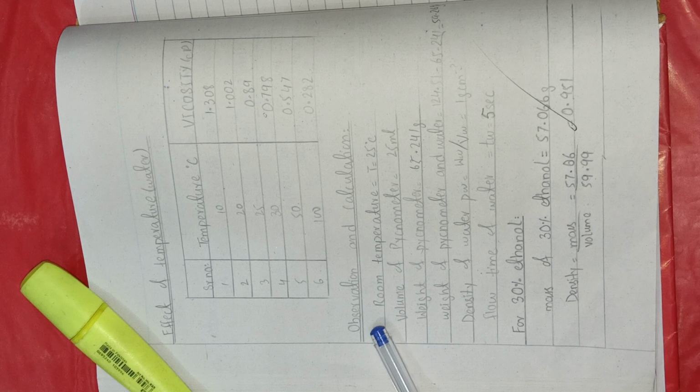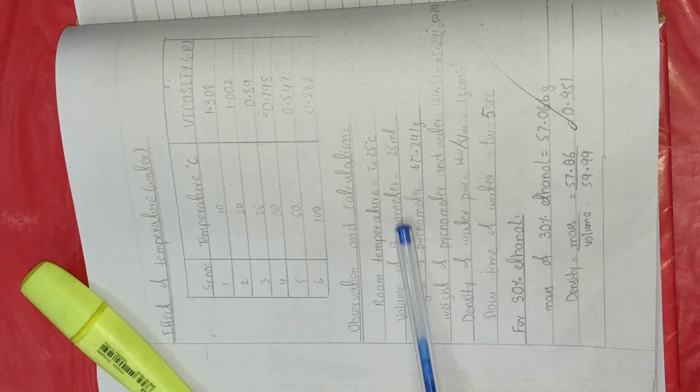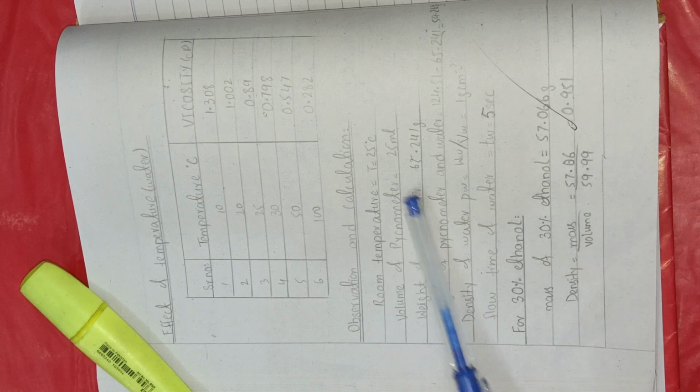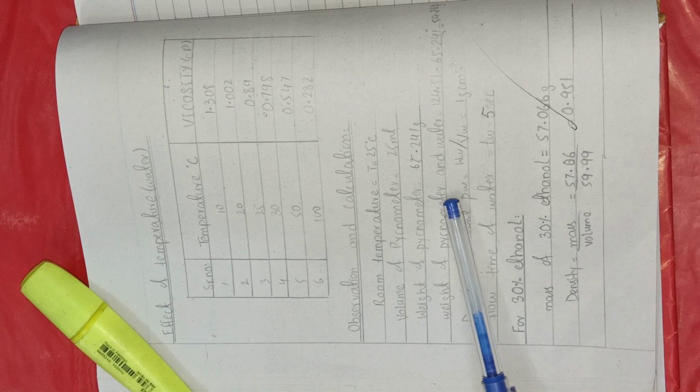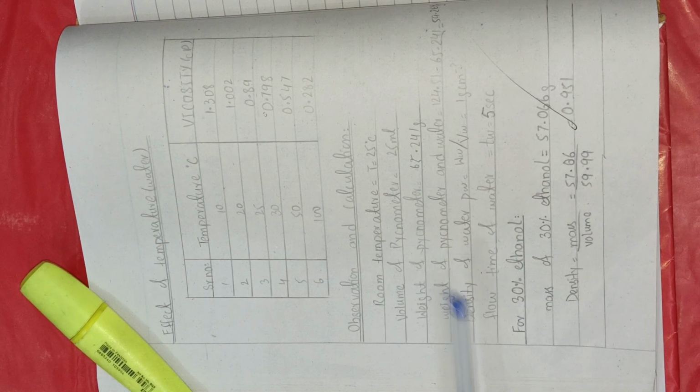Before performing that experiment, you should note that the temperature at which you are going to perform this experiment should be 25. And you will find out the volume of the pycnometer, it would come out 25 ml. You will weigh it by placing it on the weighing balance, and its weight comes out to this value.